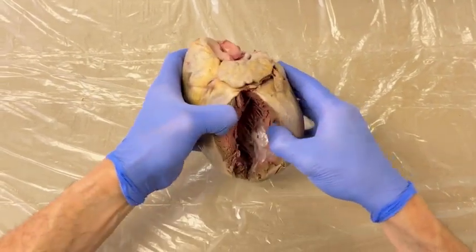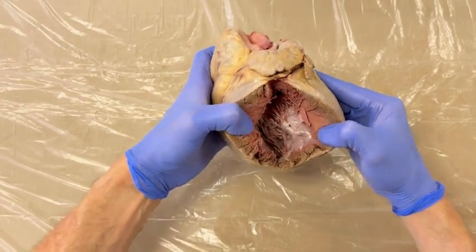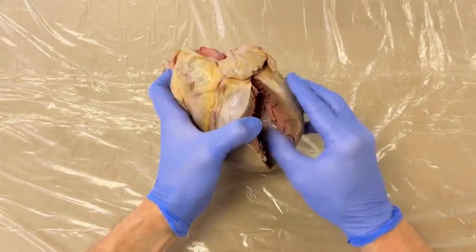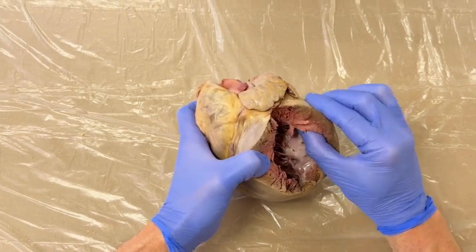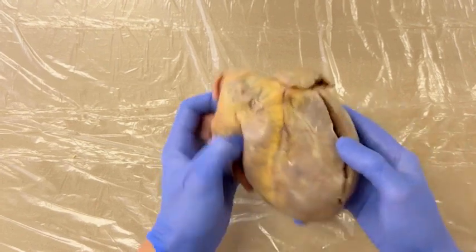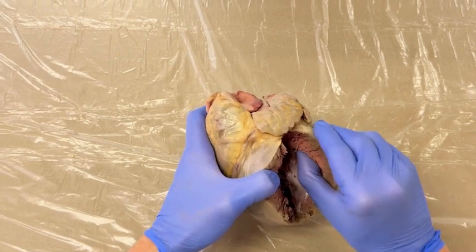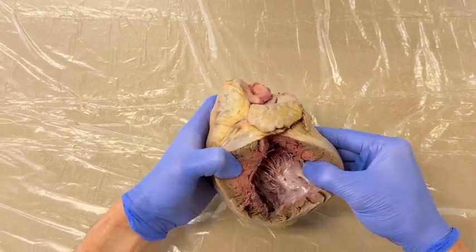So after a considerable more amount of cutting, I have the left ventricle opened. And again, I want to emphasize how thick the left ventricle is relative to the right ventricle. The left ventricle pumps blood to the body, and so it is pumping under higher pressure.